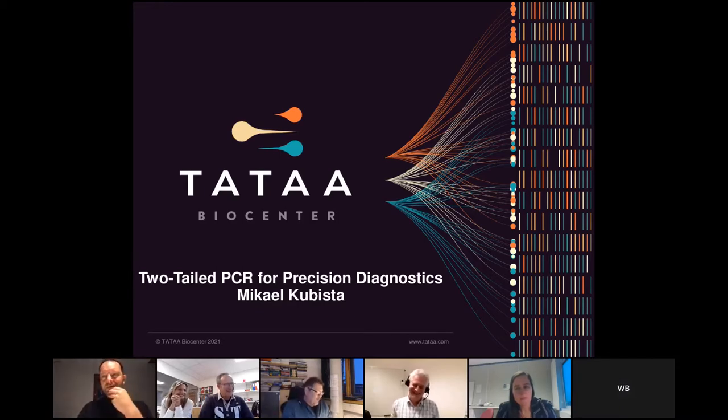So he's doing a lot of work around PCR, digital PCR, next generation sequencing. And today he's introducing us to the two-tailed PCR for precision diagnostics.